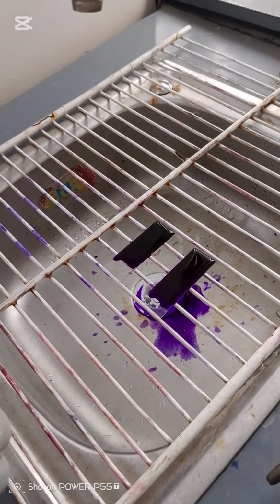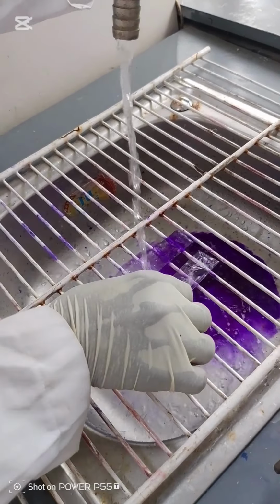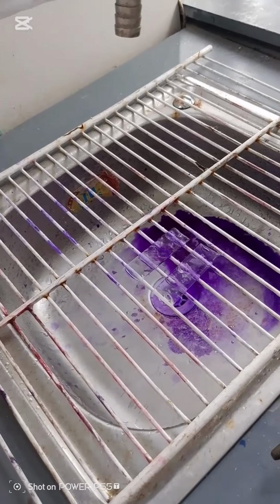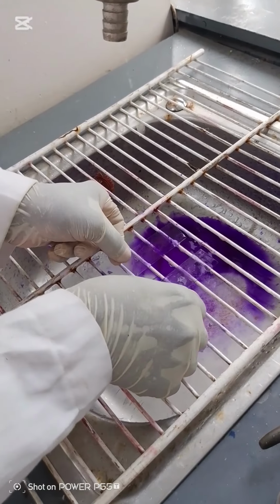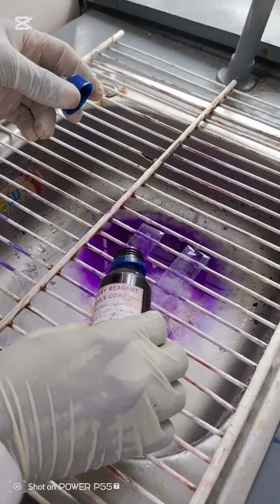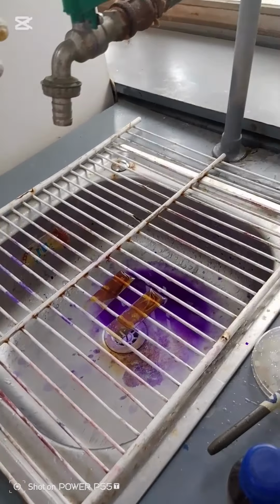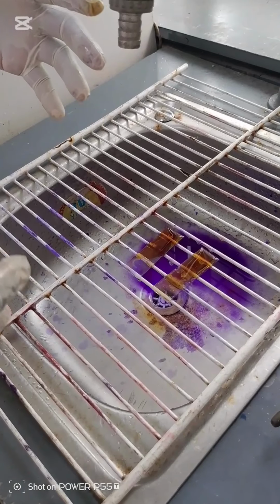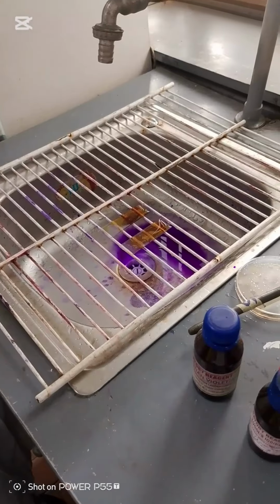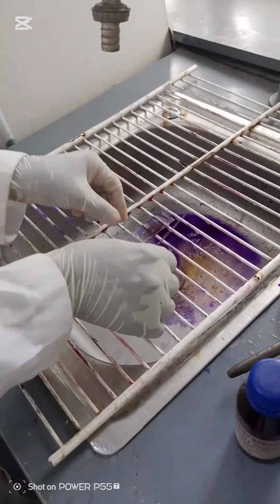Once you rinse your smear with running tap water, that stops the staining, and you add Lugol's iodine. Lugol's iodine is a mordant. It allows the primary stain to form a complex with the bacterial cell. So you leave it for 60 seconds for Lugol's iodine to form a complex with the bacterial cell and the primary stain. After 60 seconds, you rinse with running tap water and add the decolorizer.